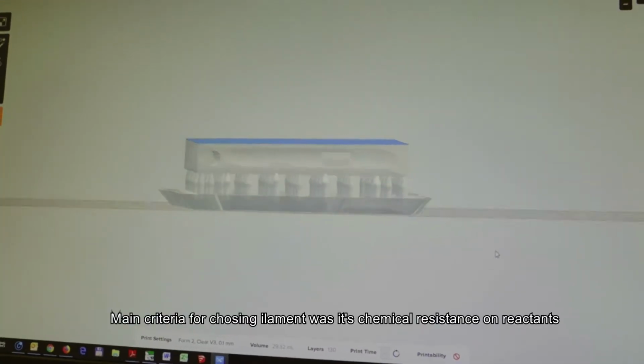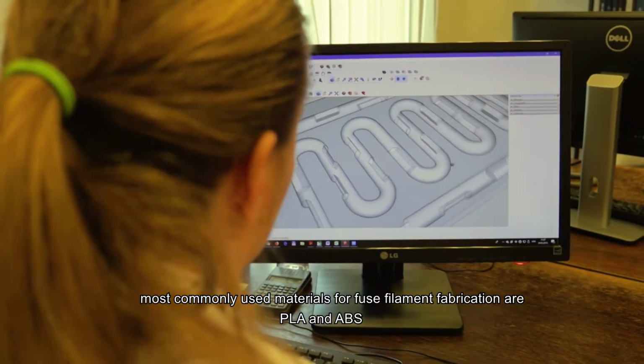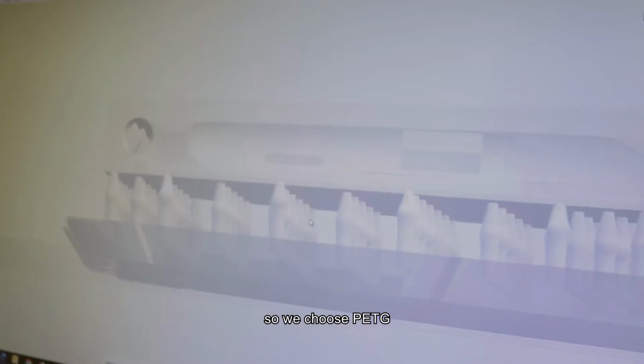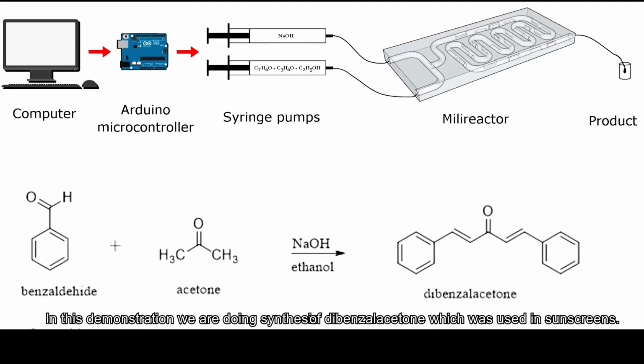The main criterion for choosing the filament was chemical resistance to the reactants. Most commonly used materials for fused filament fabrication are PLA and ABS, which are not stable in acetone. So we chose PETG.